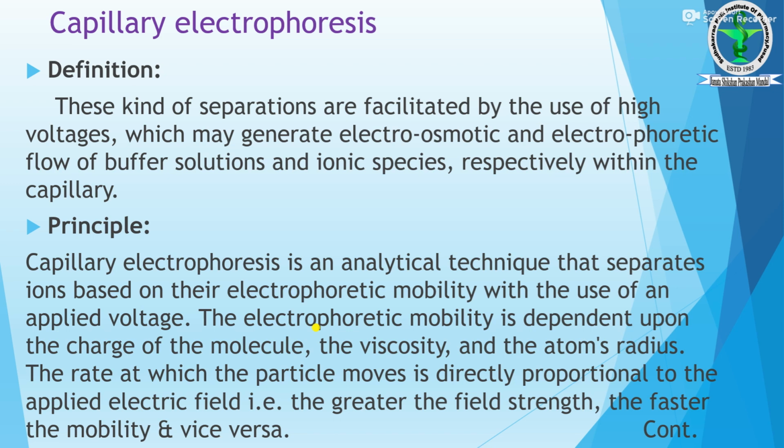So we are using high voltage, generating electroosmotic and electrophoretic flow. We are going to study both points in theory: flow of buffer solutions and ionic species respectively within the capillary. So, moving toward the principle.